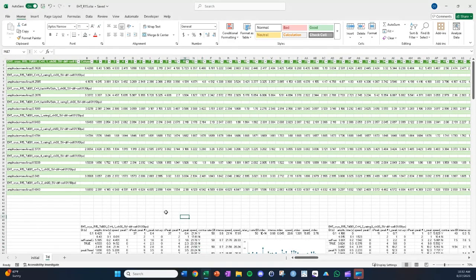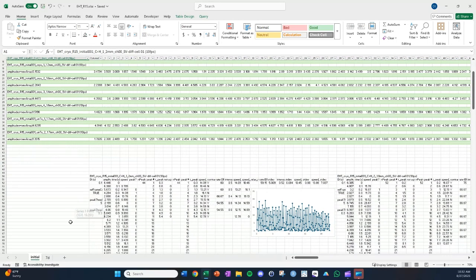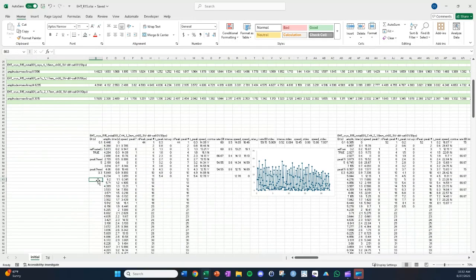All right, great. So that's one thing you might potentially want to change in the original template. Another thing you might want to change to adapt to your use is that the way I've gotten the data from MYOCYTER is that I've chosen a reference frame, and I've chosen that reference frame to be contraction. Now, this for your case might be different. I think if you let MYOCYTER do it automatically, it'll likely choose a relaxation reference frame, in which case you might want to change all of this value of true to false in your version of the template.